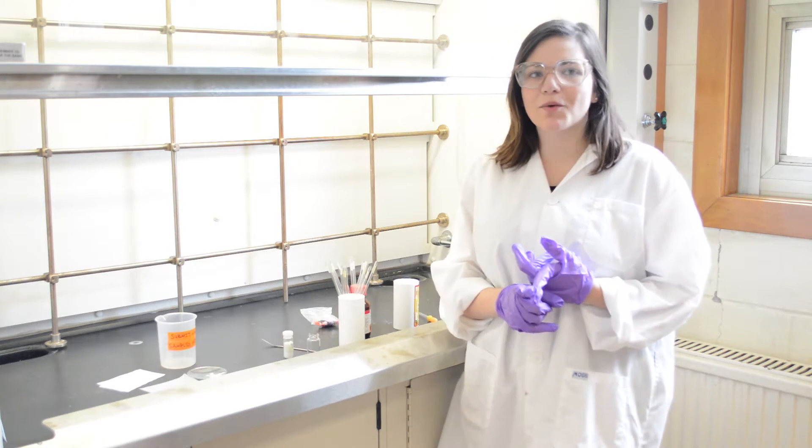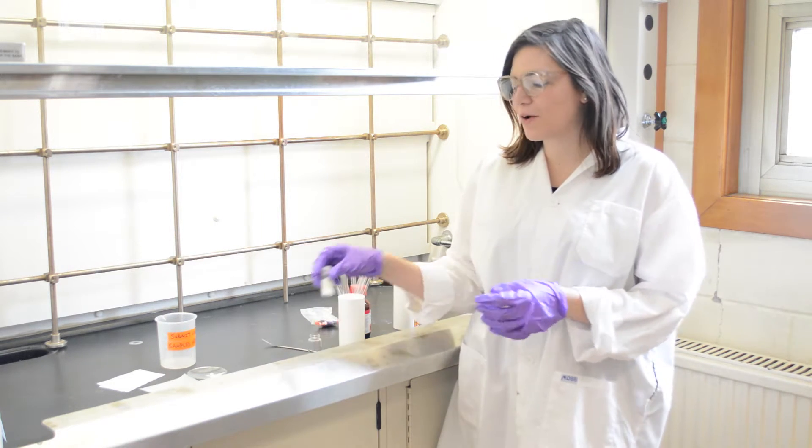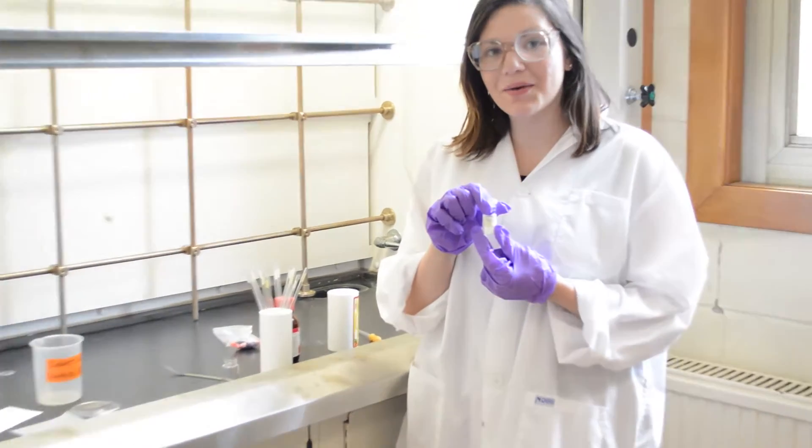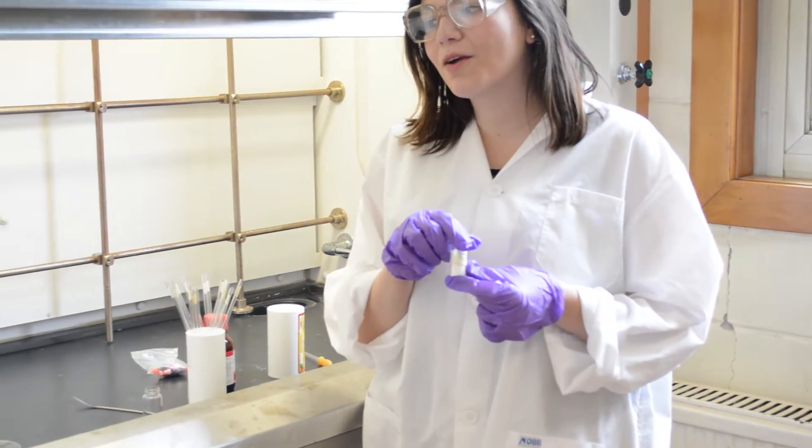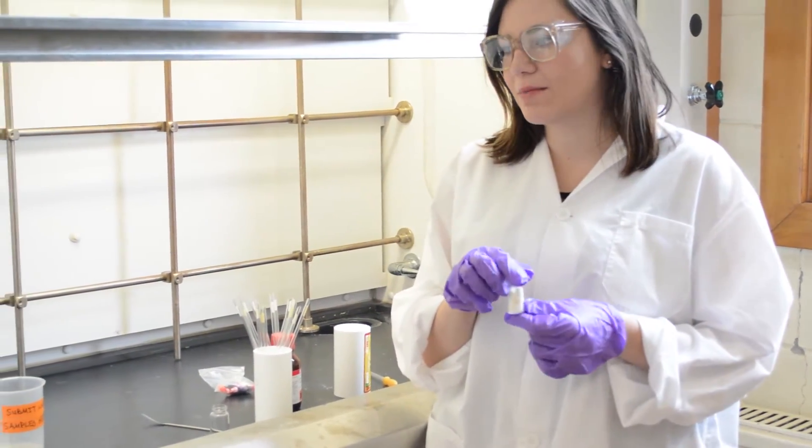For proton NMR, you're going to want to use 2 to 10 milligrams of your sample compound, and for carbon NMR, you're going to want to use 10 to 50 milligrams of that compound.